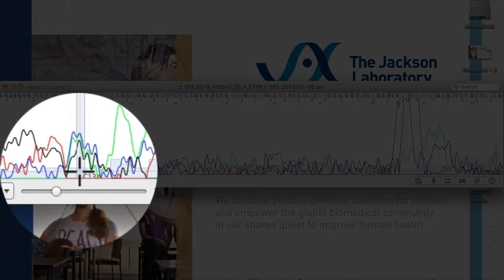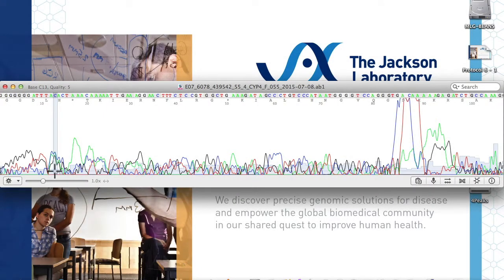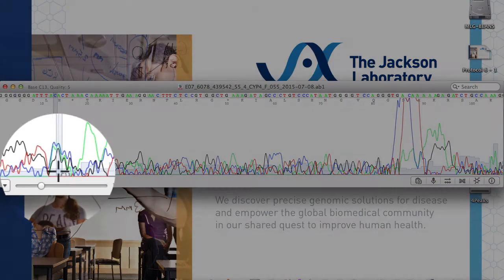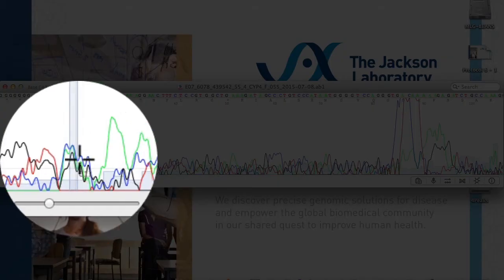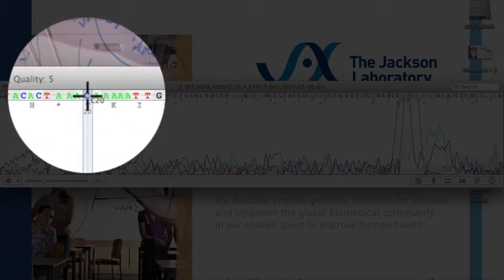The gray bars behind the line traces represent the quality of the base call at that location. These quality bars may be represented differently in other programs, but most will have them. If the call is of good quality, the bar should fill the height of the window. On the top of the window, letters represent the base called by the software at each nucleotide location.